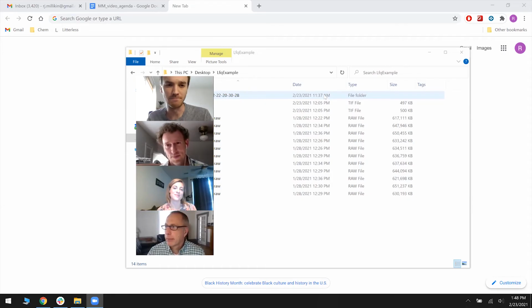Right. Yeah, no, and the whole open searching has been around even back in the day with Mascot error tolerant, right? But yeah, there's a grain of salt required. And I think the approach and the validation and being able to look at it is key. So that's really cool. Michael, do you want to just talk about the dataset we're going to analyze?